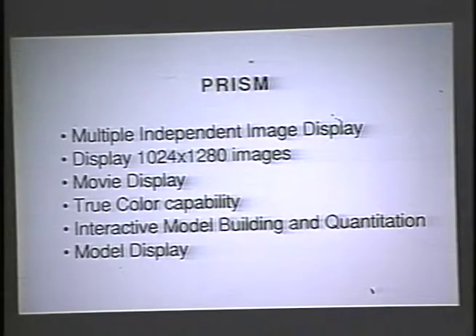And so what we've done is we've developed what we think is a very powerful interactive graphics system, or approach to graphics analysis, actually, for doing this. One of the things I pointed out before is this idea of multiple independent image displays, multiple windows on the screen at the same time. So you can be comparing and contrasting different things.